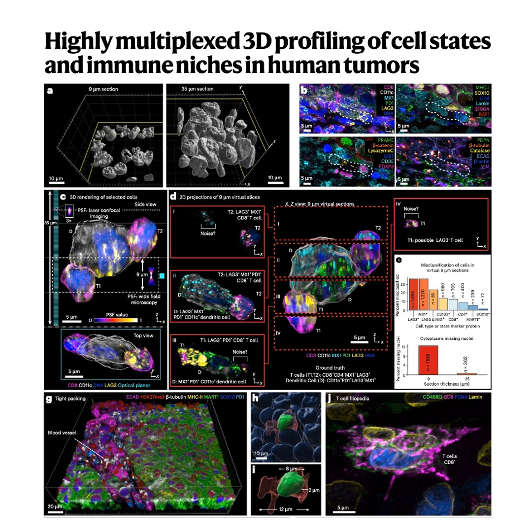Well, they saw B cells, another type of immune cell, physically flattened against the inner wall of a blood vessel. That morphology is classic for cells preparing to migrate out. But even more strikingly, in one incredible 3D snapshot, they captured a B cell with its nucleus, the main part of the cell, actively traversing the vessel wall it was partway through, while the rest of its cell body, the cytoplasm, was still inside the vessel lumen. Wow, caught mid-transit. Exactly. A highly complex, dynamic action that happens relatively quickly. Something that would be completely obliterated, just erased, by the random chance of a thin 2D slice hitting it at the right nanosecond. You'd never recapture that complexity.